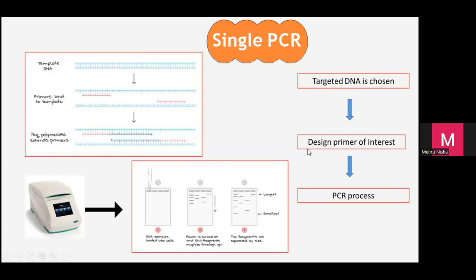I cari primer yang spesifik untuk Giardia duodenalis di gene bank. Kita boleh synthesize. Secondly, kalau tak mau buat sendiri, kita boleh ambil primer di mana researcher lain yang sudah guna di kajian mereka. Yang ni pelajar-pelajar boleh cari dari jurnal lah, baca jurnal, primer interest yang orang lain dah guna untuk diagnostik, kamu boleh guna. It's no problem sebab primer je. Tapi untuk diagnostik lah, just for diagnostik, you design primer, buat PCR.